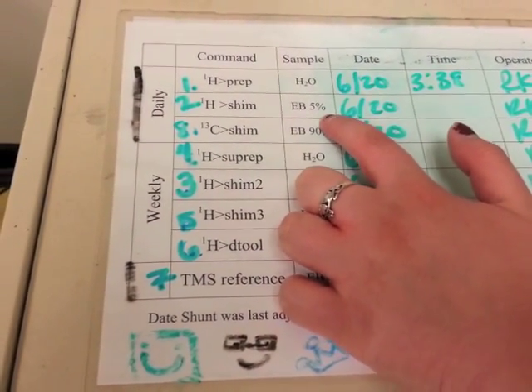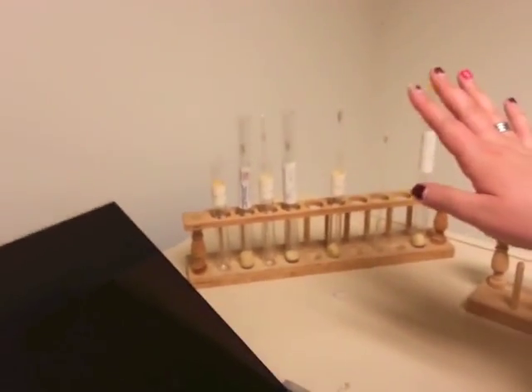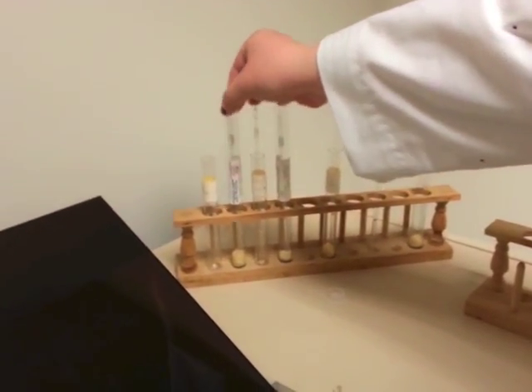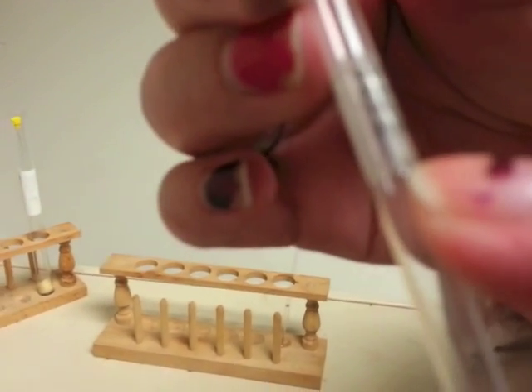For the SHIM routine, we need the 5% ethylbenzene standard. All of the standards are kept in a test tube rack next to the NMR. This one is the 5% — there are labels on them telling you that it's 5%.